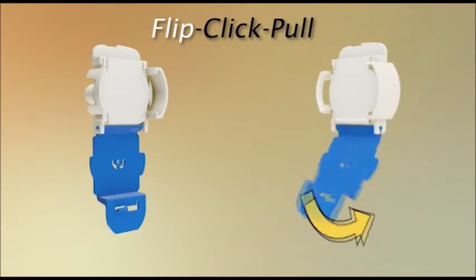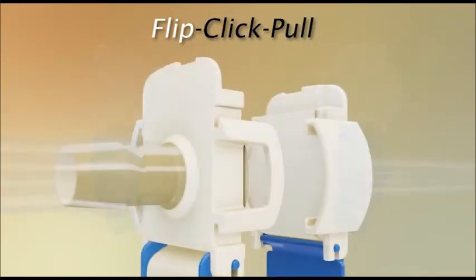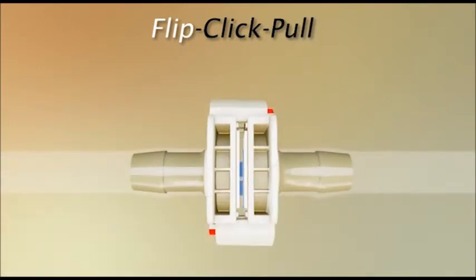Un-snap and flip down the protective pull tab cover on each connector half. Align the connector halves with the pull tab covers hanging down. Slide the two halves together as the arrows indicate. Independently squeeze each side of the connector until you hear the Kolder click.